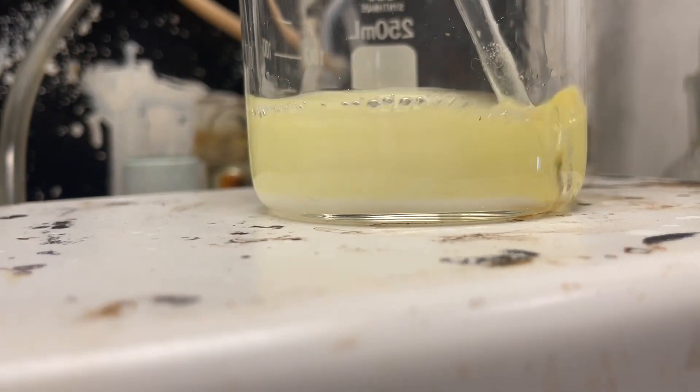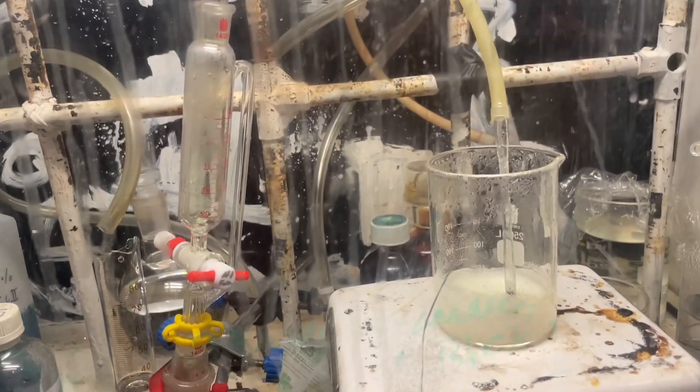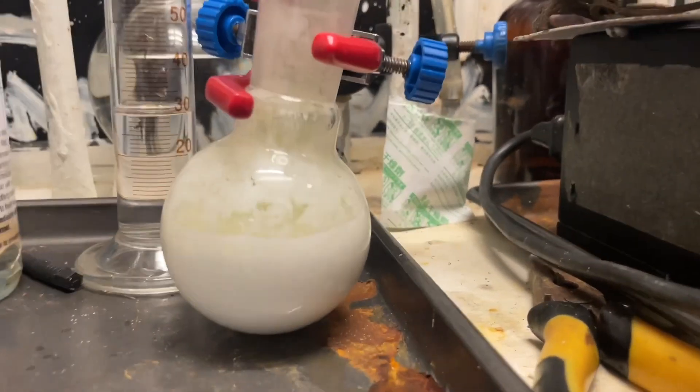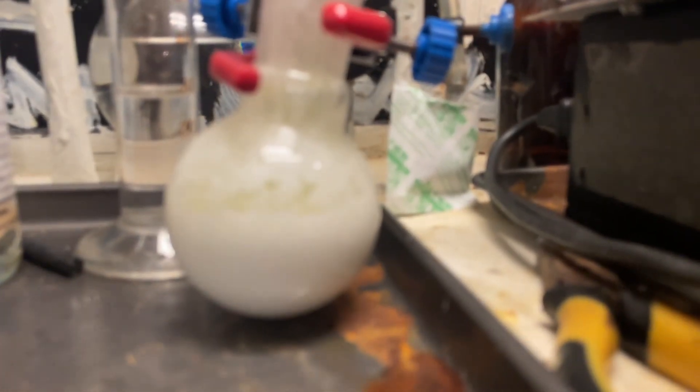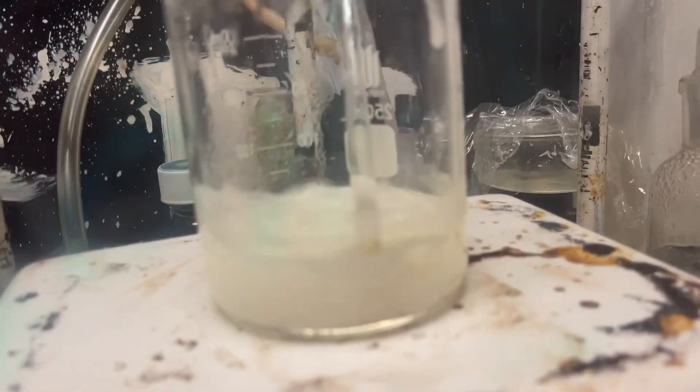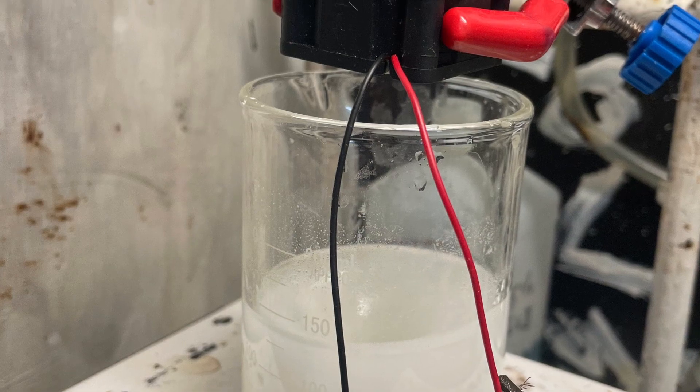Here's a hot solution of potassium hydroxide and potassium iodide, and I simply ran a random amount of chlorine gas into it. After it stopped reacting, done. Very simple synthesis — just potassium iodide, potassium hydroxide, boil it and run chlorine in.